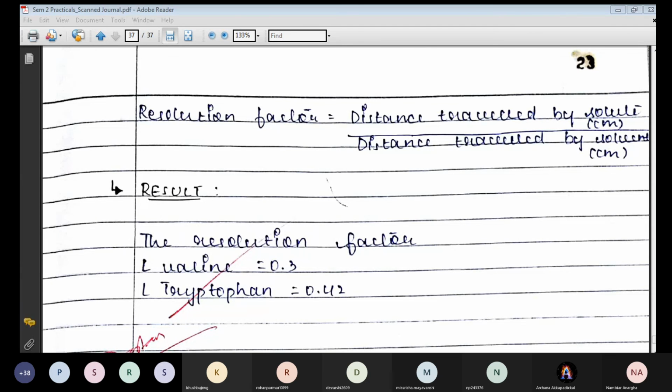ऐसा भी हो सकता है because every professor has got a different style. So once you go through the practical, make sure that you look deeper into it and you look into various backgrounds. जैसे लास्ट टाइम बोला था ईडीटीए में उस बारे में ज़्यादा पढ़ना, अब यहाँ पे क्रोमेटोग्राफी और आपका तो यूनिट भी है इस बार, तो आपको थोड़ा और डिटेल में पढ़ना रहेगा कि सारे टर्म्स जो आते हैं, क्योंकि ये रिलेट करके आसानी से क्वेश्चंस प्रोफेसर्स पूछेंगे ही, because you are having it in theory also. So don't rely just on the questions that we are discussing. We are discussing it from our point of view. You have to take it further also.